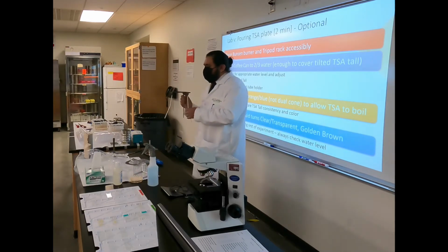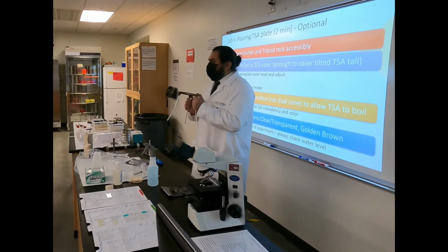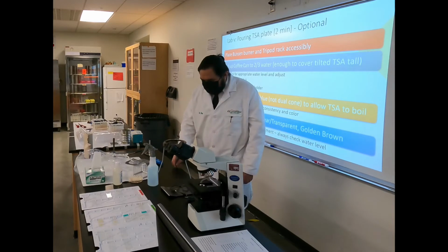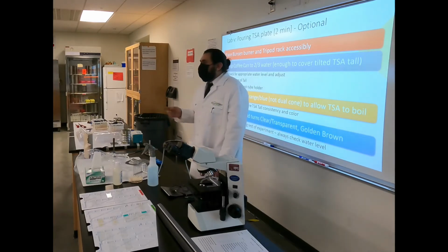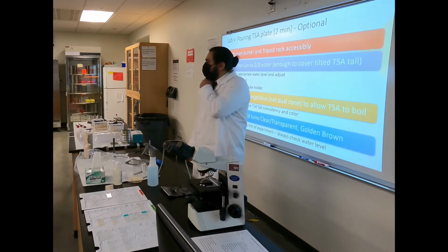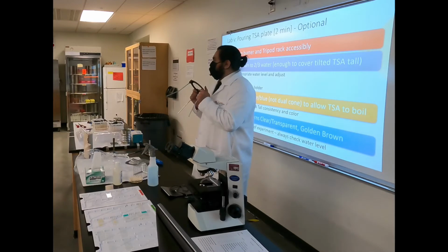Just like the scope we're going to learn a little bit later, these guys need to be lifted. So that means that wherever you place it, don't drag it, because you're going to hear this. That will make me angry. But two, they're actually removing some of the coating off your bench, the protective coating. So anytime you want to move this, always lift these guys.